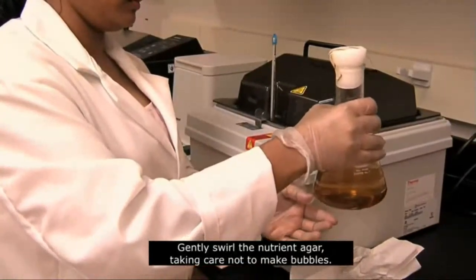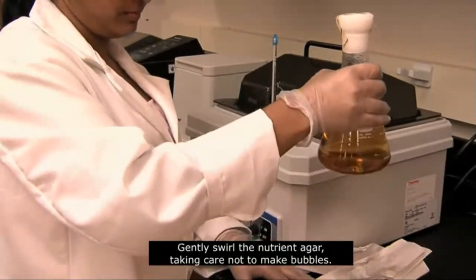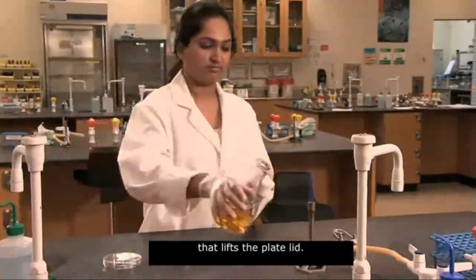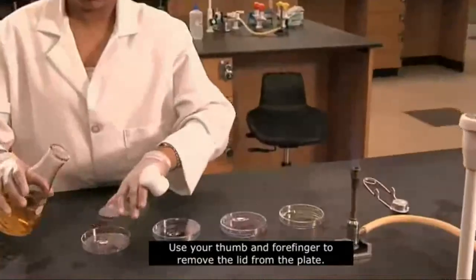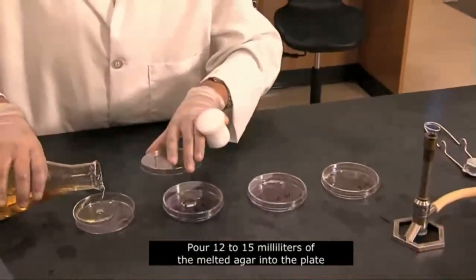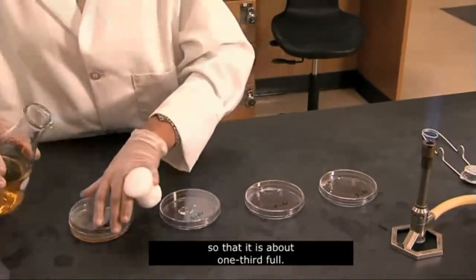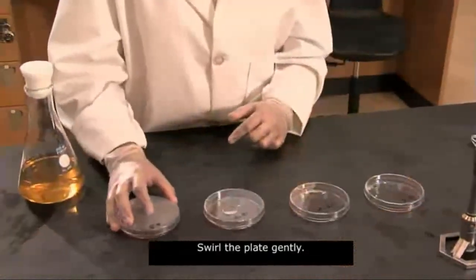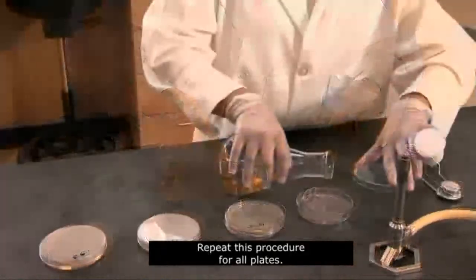Gently swirl the nutrient agar, taking care not to make bubbles. Remove the plug with the pinky and ring finger of the hand that lifts the plate lid. Flame the mouth of the vessel. Use your thumb and forefinger to remove the lid from the plate. Pour 12 to 15 milliliters of the melted agar into the plate so that it is about 1/3 full. Immediately replace the lid. Swirl the plate gently. Repeat this procedure for all plates.